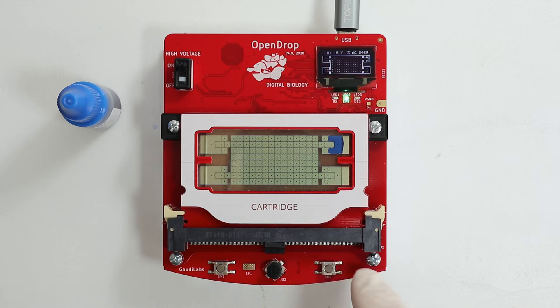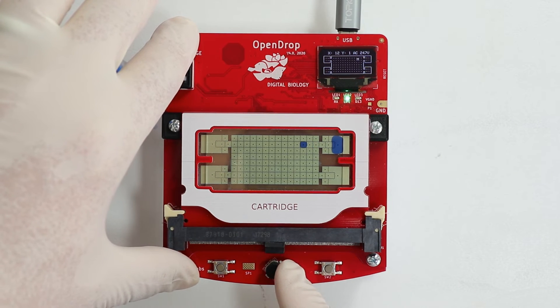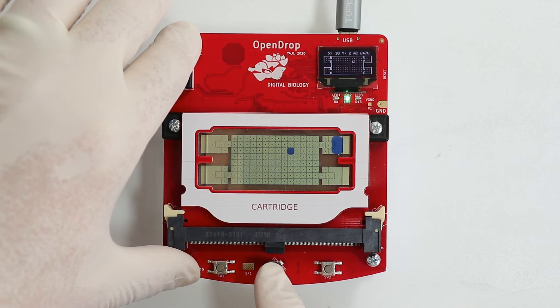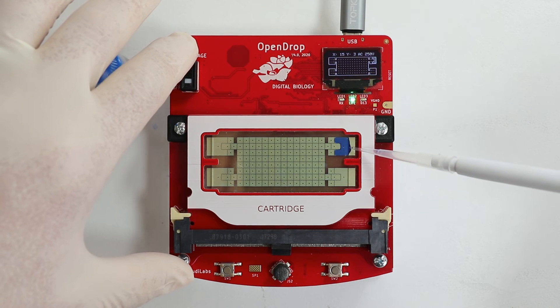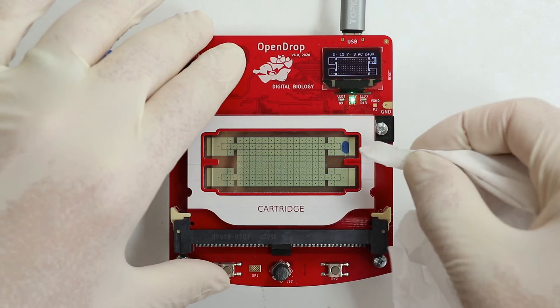Now press switch 2 to start the dispensing process. Once the droplet is separated, you can move it with the joystick or with the PC software. To empty the device, move the droplet back to the reservoir. You can empty the reservoir using a fine pipette or with a clean paper wipe.